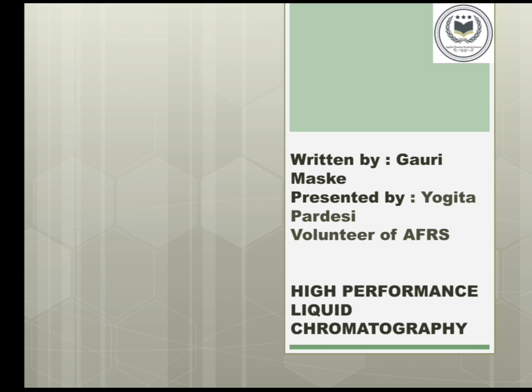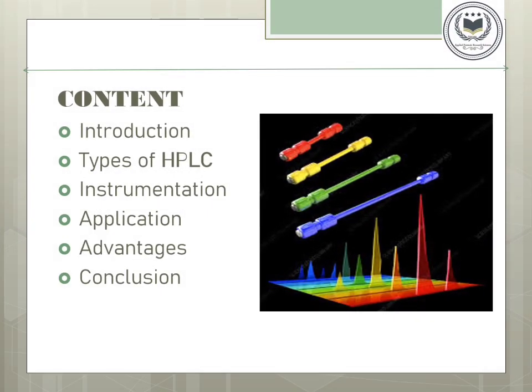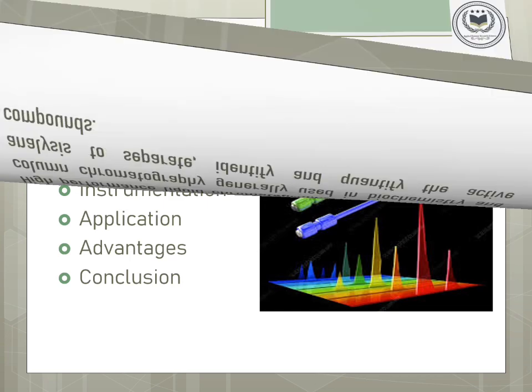In this video, we are going to learn about high performance liquid chromatography. So let's start. The content of this video covers the topic introduction, types of HPLC, instrumentation, application, advantages, and last, conclusion.